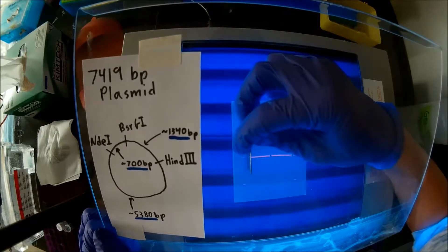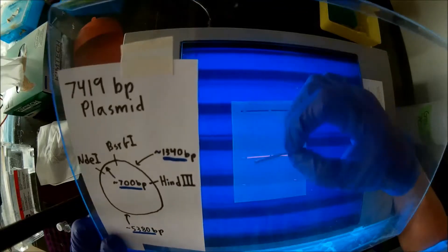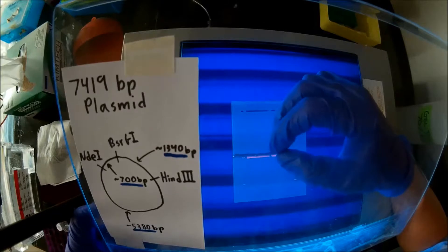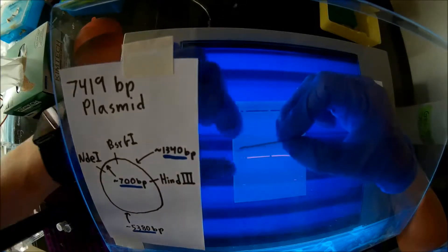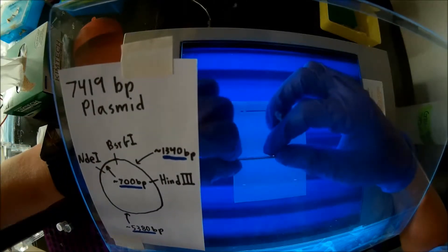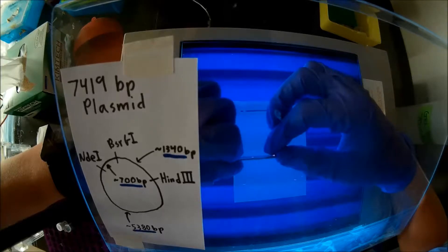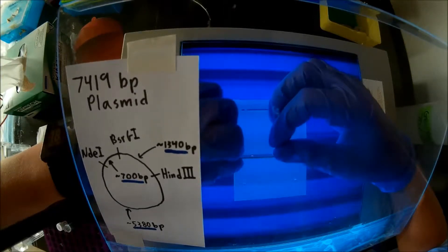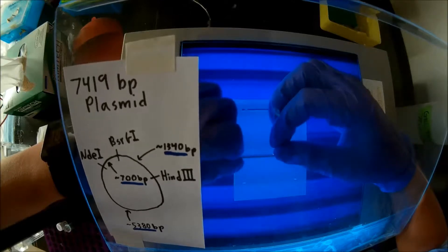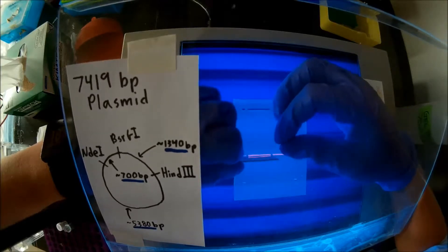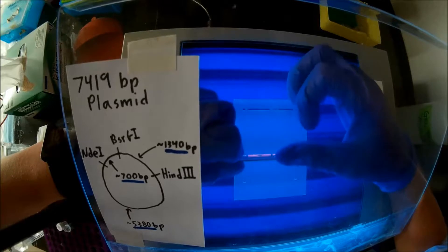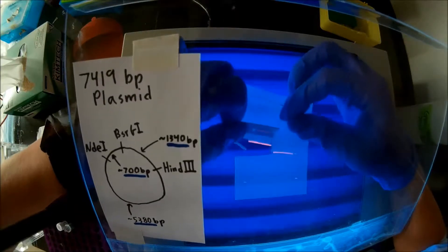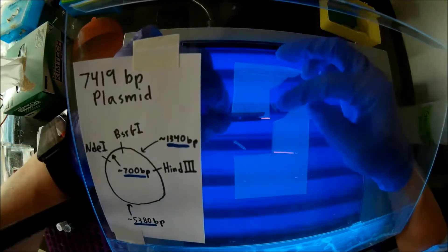When I cut these, you want to cut as close to the band as possible because the agarose will compete for adsorption sites on either your silica or whatever membrane you may be using on a spin column. So, it's a good idea to try to cut as small of a band as possible. So, again, I'm cutting right next to the fluorescent band. Okay, so I'll just kind of tear my gel apart like that.